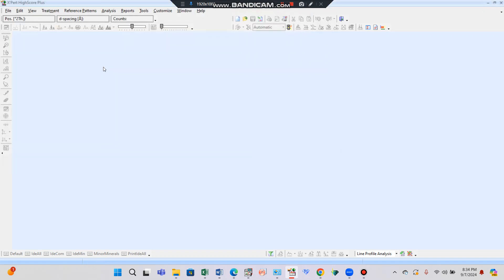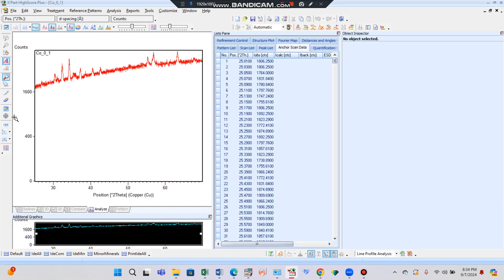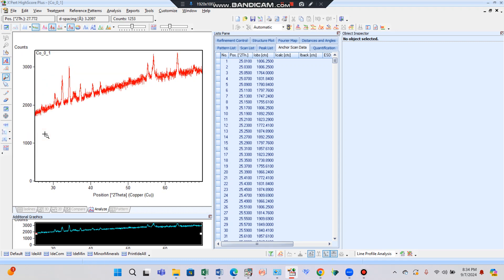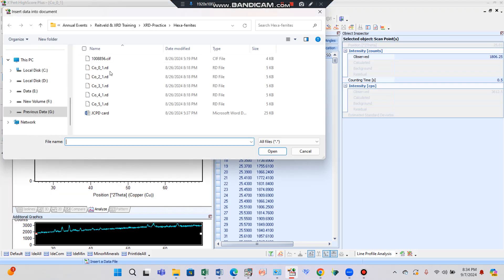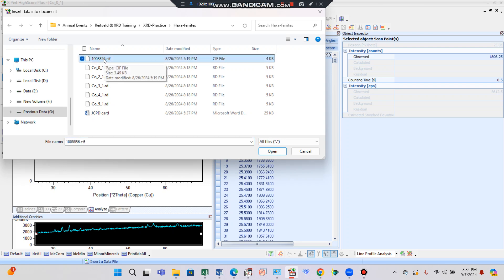Double-click this file. Here you can see the y-axis; set this graph as linear y-axis and you can see the peaks become sharper than before. Then click File and insert the file with the extension .cif. The CIF file is a standard file you can obtain from different sources on Google, and it contains the data of your pure structure.